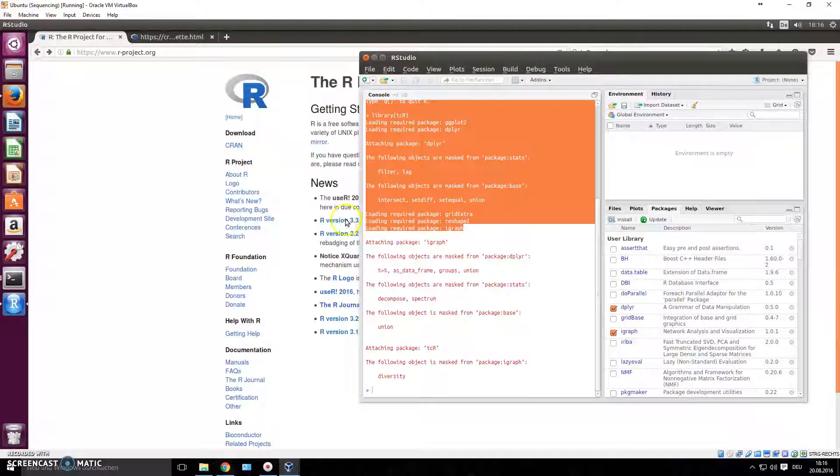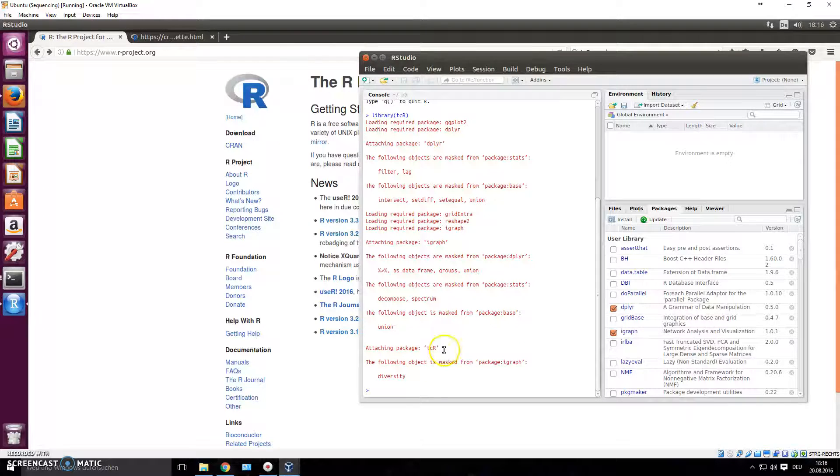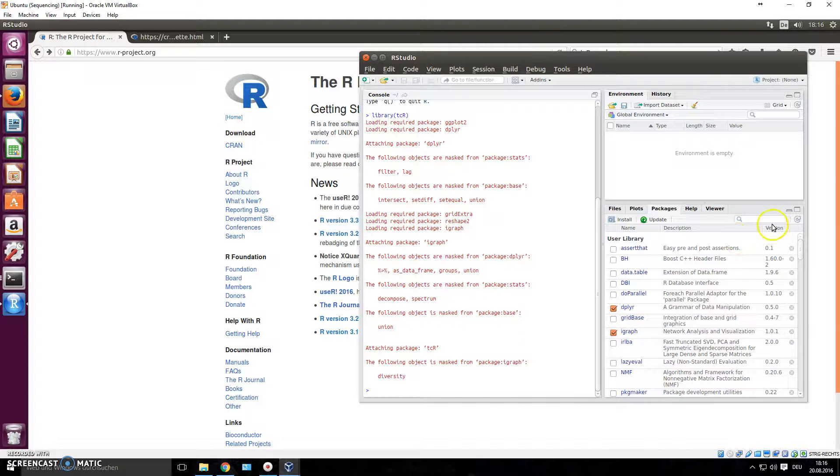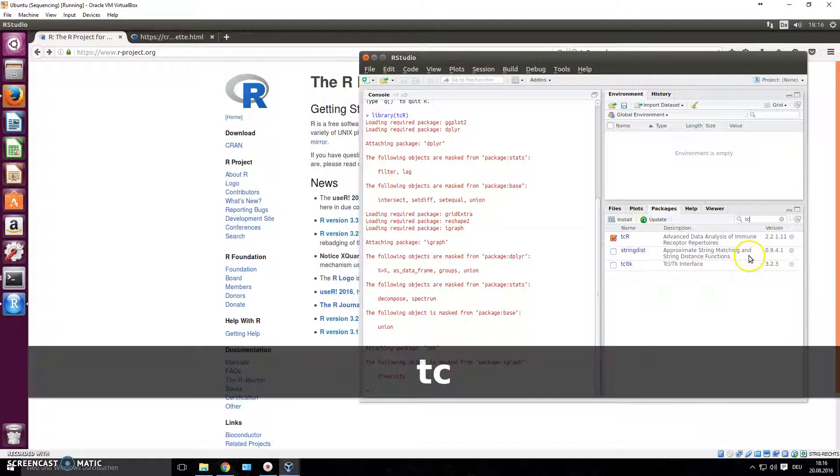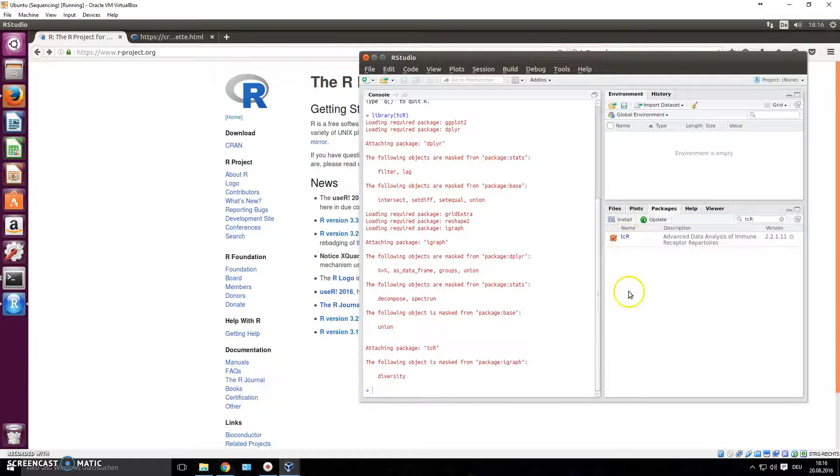And there you go, it loads the package for you. You see it loaded every other package that it requires to run as well. And that's it, tcR is loaded. If we search tcR here, there should be a tick on it now. There you go, there's the tick and this is the package.